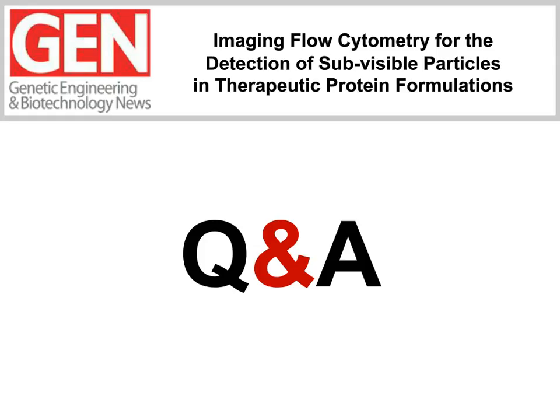Okay, and our first question is for David. David, one of our audience members would like you to define your difference between stirring and agitation. Sure. Stirring refers to the use of a small stir bar to stir the solution, and agitation refers to using a shaker where the protein solution is put in a glass vial with a stopper and then is shaken. So that's the difference between stirring and agitation.